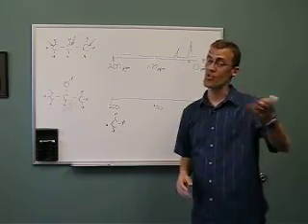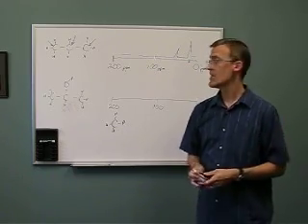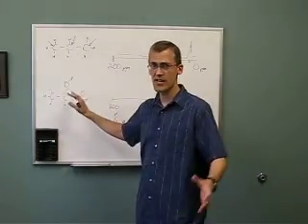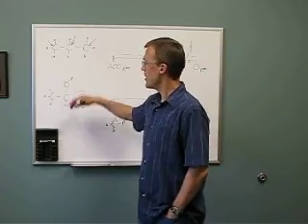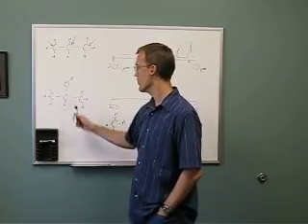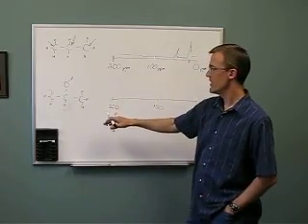So you can go to the charts, the types of things that you have in your lab handout you're going to be working with in lab, and you can actually start to assign some of these because of where they show up. Alright, but let's add something electronegative. I want you to see this a little bit more extreme. Any branches, double bonds, triple bonds, those things, same effect really as these electronegative groups, are going to cause these things to be really far downfield.